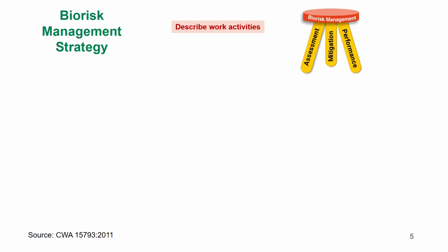After you describe the work activities, you know everything that you're doing in the lab. The next thing you need to do is identify the hazards and any threats that may be involved in these work activities. As I touched on earlier, each of these activities involves a biological agent being tested or handled, so mostly the hazards will be biological in nature.